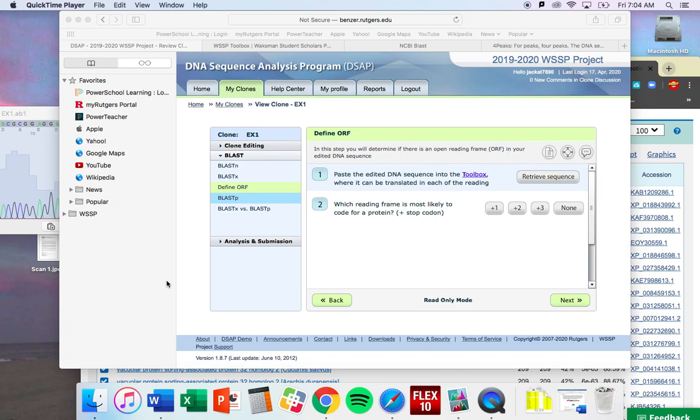Happy Friday, researchers. On this installment of the excitement of DSAP, I'm going to walk you through defining your ORF, your open reading frame, and also talk you through several of the analysis questions so that you remember what you're going to need to do.